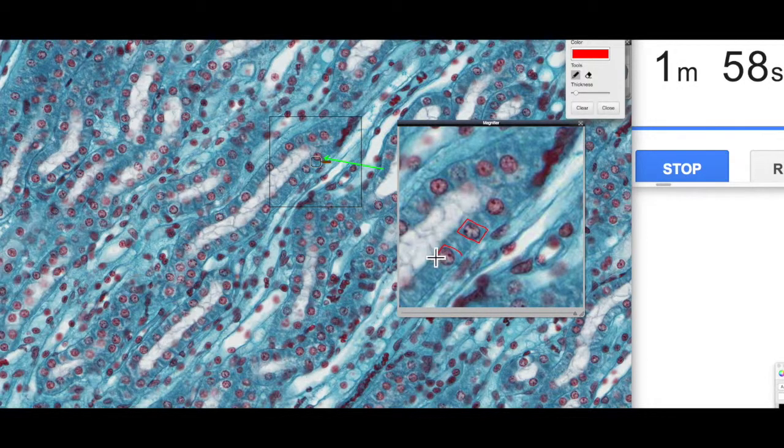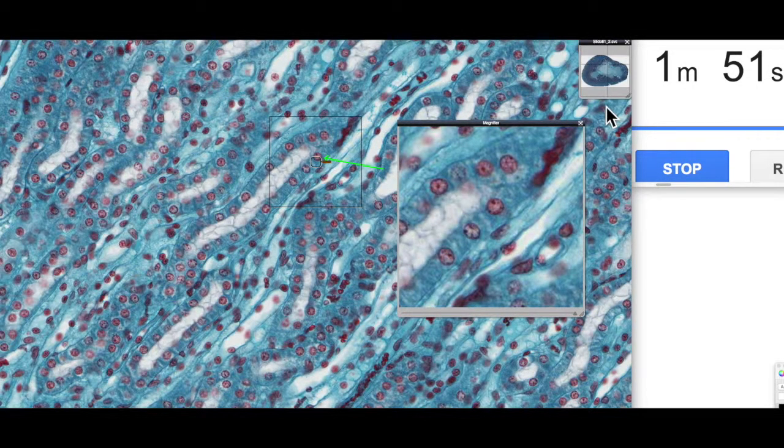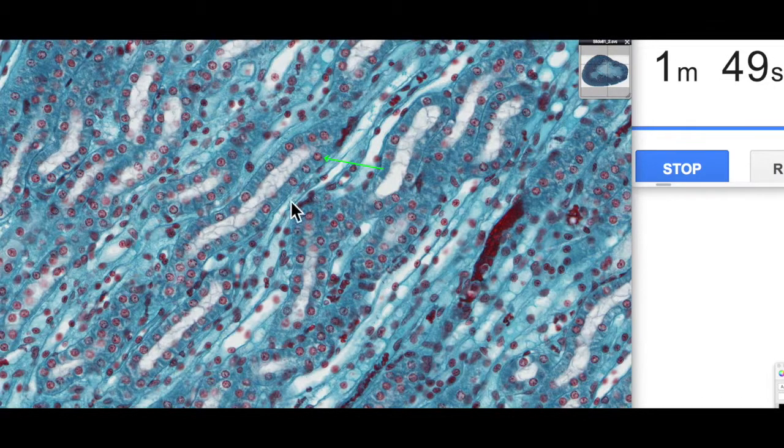You can see them all in a row here. The cells are as tall as they are wide, which is typical of a cuboidal epithelium. That's typical of what we find in the kidney tubules.